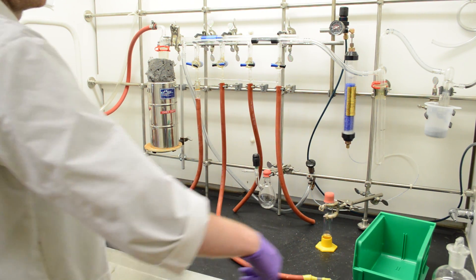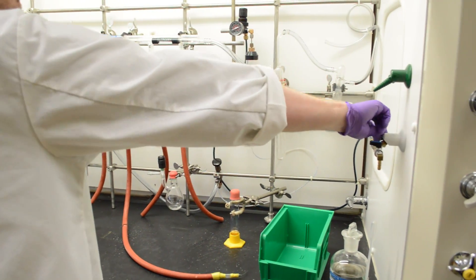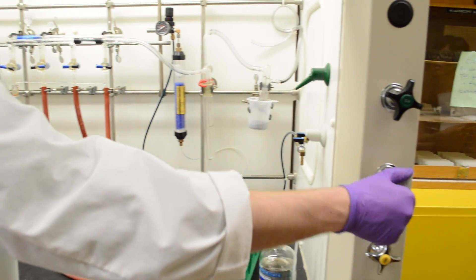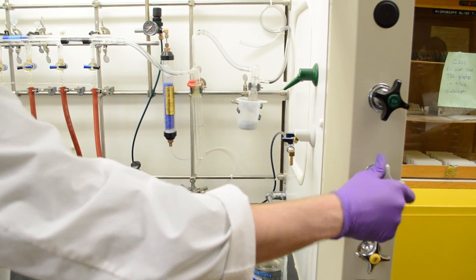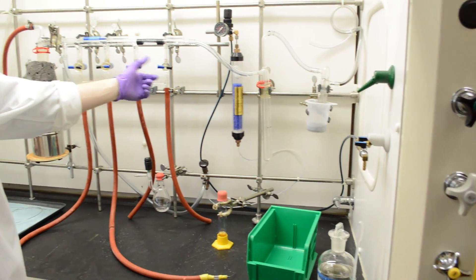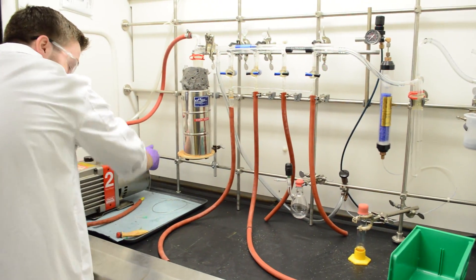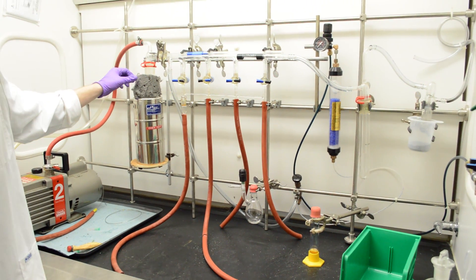So when you're shutting this down, first thing you want to do is make sure you turn off the nitrogen. Make sure all of these are actually closed. You can just turn the pump off. That's as simple as that.